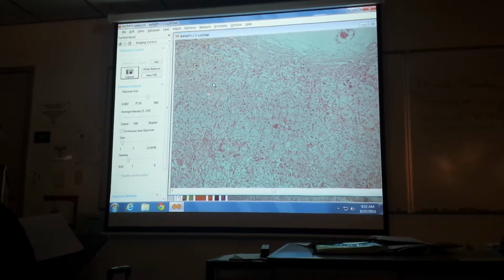What if I point to somewhere in the middle? The cells are kind of arranged in vertical cords. Kind of. That's zona fasciculata. It's hard to see on this picture. When you look at the scope, it looks much better. This down here is reticularis.